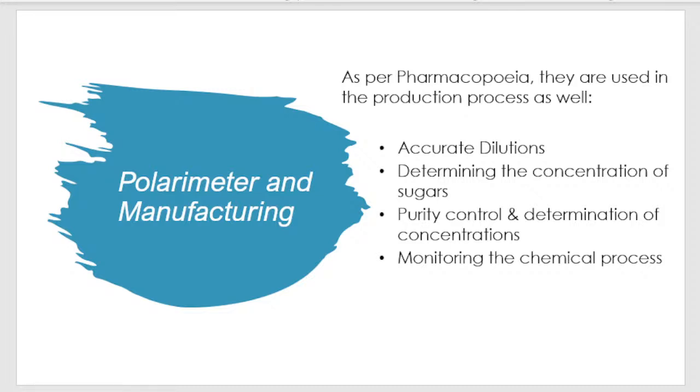So it's not unusual for some pharmaceuticals to not need a polarimeter while others do. It's not unusual for a pharmaceutical production plant to not need a polarimeter.